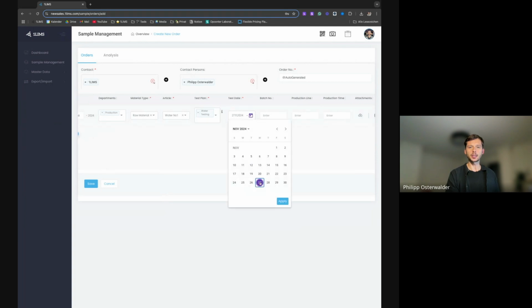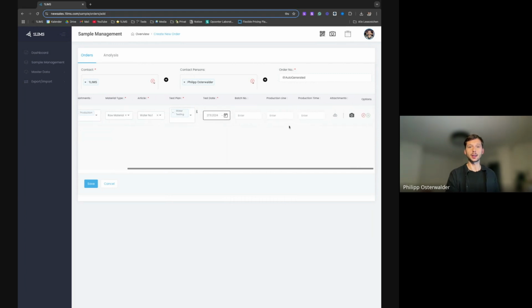We have maybe an express sample because the production is running, so it should be done immediately. We have a batch number. Let me take in 555 from production line 3. Production time is right now 05 minutes. I can also attach some different documents or take a screenshot if the sample is broken or spilled over or something like that. So I save this.